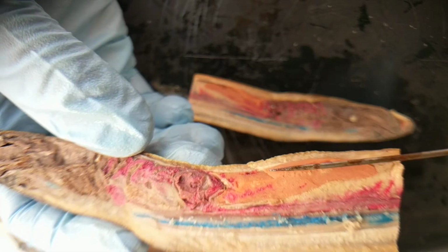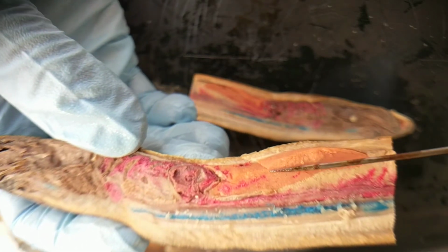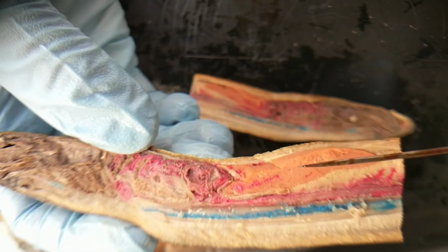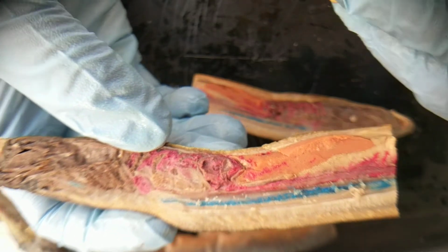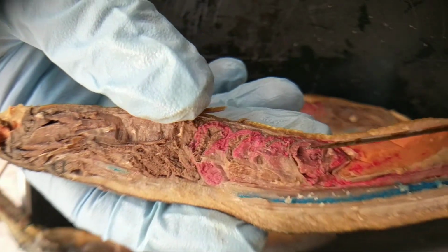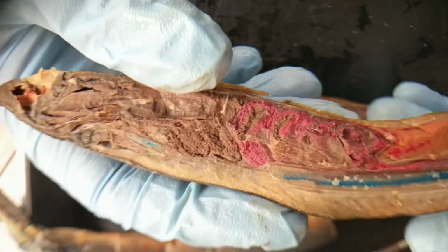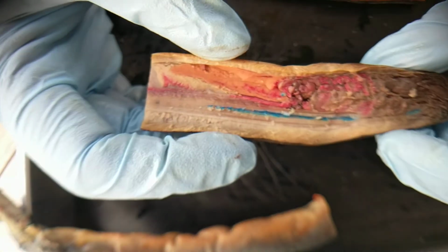This is the liver. It's funny, in all sorts of animals, you can tell by the texture of the tissue what organ it is. You can always tell a liver. It's very, very dense and crumbly. Heart tissue just looks like this really tough muscle. That's heart. All right, and I wanted to show you what else. Let me get my list here.